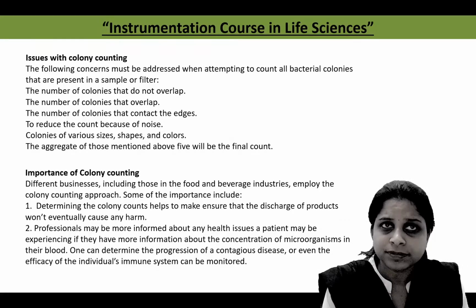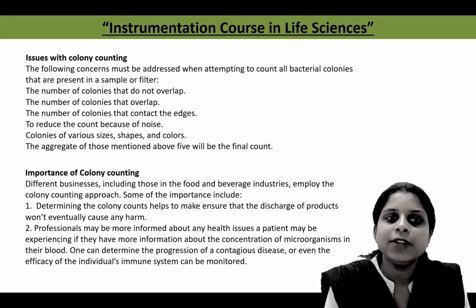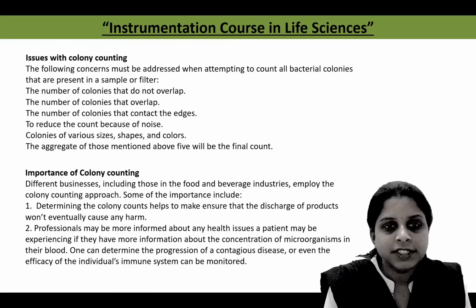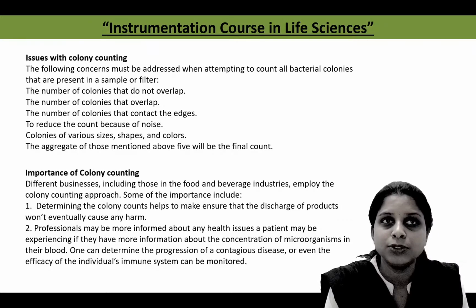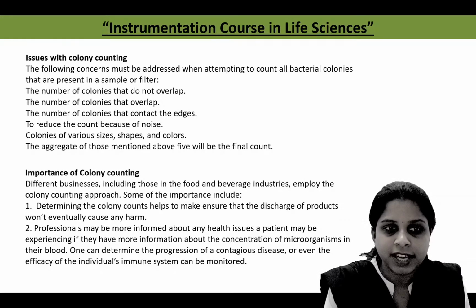Care is taken to reduce the count because of noise. During colony counting, noise can be created which can give rise to false positive results, so care has to be taken to reduce that noise so that accurate results are obtained. Colonies of various sizes, shapes and colors are also produced during growth conditions, and these have to be counted during colony counting. There is also some importance of colony counting.